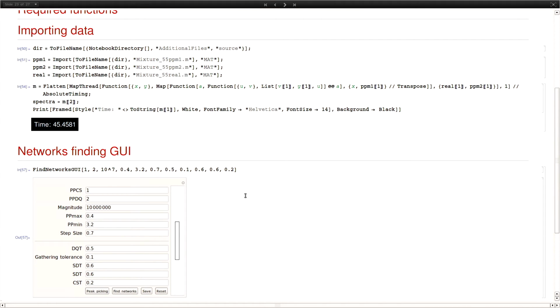Yeah? So as I understand, each carbon-carbon pair is represented by 2 dots in the horizontal line. Right. And this left line goes to the center. What's that? That diagonal line? Yes, it's a diagonal line because in this kind of experiment you have equidistance between the carbons. They are equidistant, so I just put it there to show that you have to fulfill that theoretical condition.